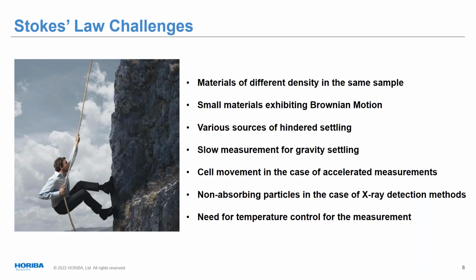Now, when we go with the centrifuge, we have one benefit working for us, and that is the fact that you now have more than 1 g of gravity causing it to settle. So because you're putting more force on it, you're going to have a lot more sedimentation velocity than you are Brownian motion. So one of the reasons people like the centrifuge is you can certainly go well below 1 micron. We've run well below 0.1 microns, even all the way down to about 10 nanometers. So that's a benefit when you switch from gravity to the centrifuge.